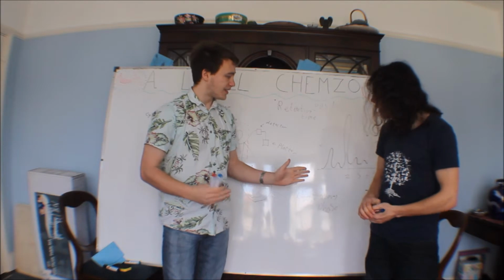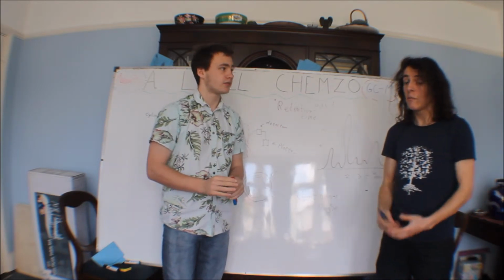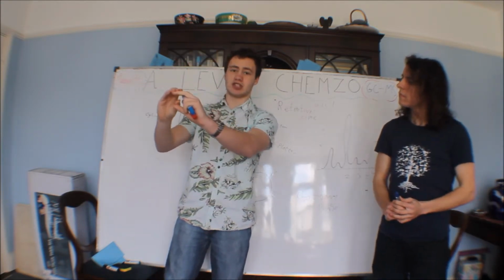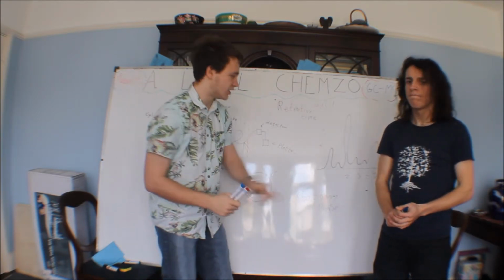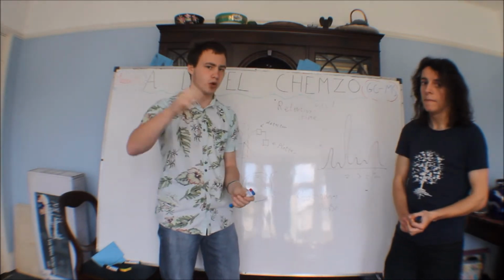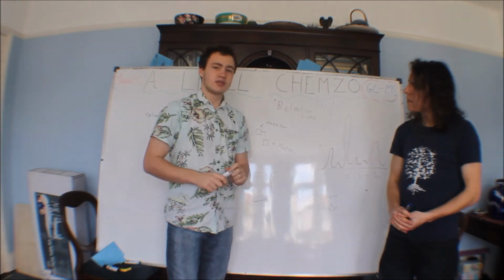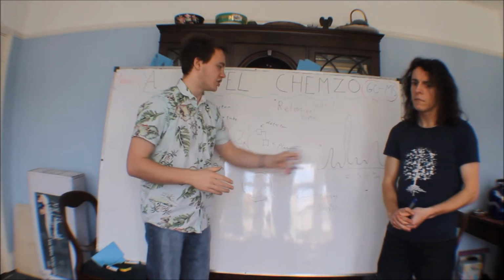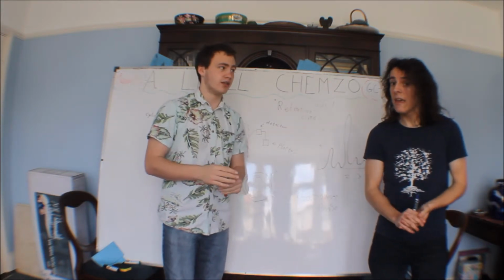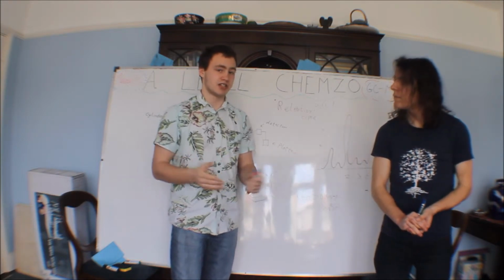A lot of things also have the same retention time, it's just a problem in general. Which means you can't really tell them apart. So say the aldehyde and the ketone had the same retention time and there were equal concentrations, it's not so much that it's been masked, it's just you wouldn't be able to distinguish between the two, it would show as one peak. Which would be a problem there. And the same as before, if you've got nothing to compare it to, if it's a brand new chemical or functional group, then you won't know what it is. If there's nothing to compare it to, it means nothing.